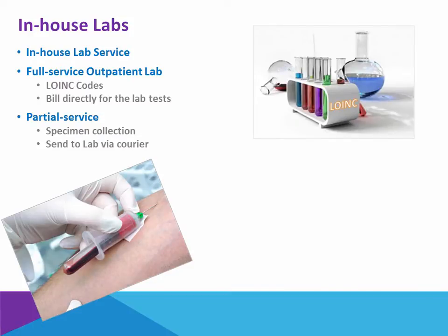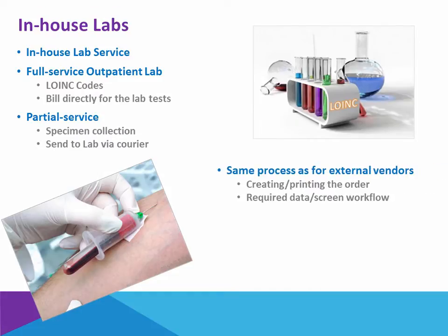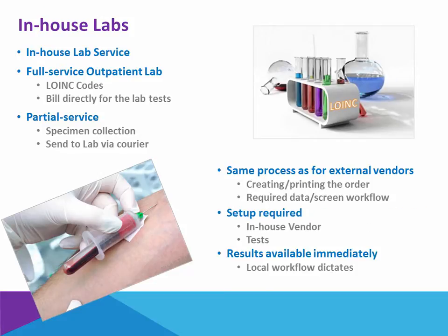Whatever the case, when it comes to ordering the lab within Prognosis, we've already covered creating and printing lab orders when it's an external patient service care center. The process of doing it in-house is really no different as far as the required data and the screen workflow. There's just a couple of exceptions with regards to setup and the fact that you can post results immediately.